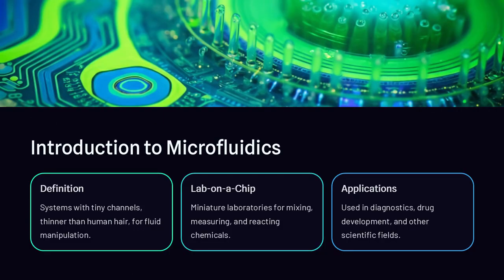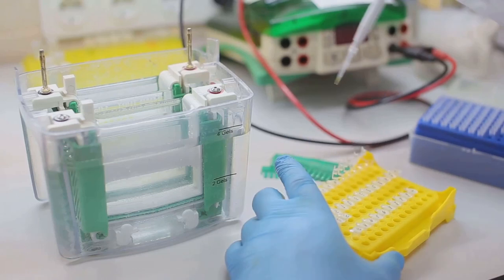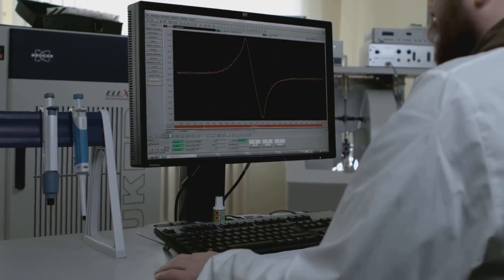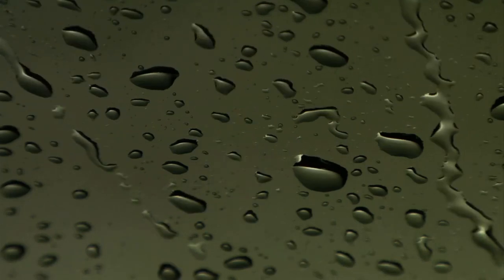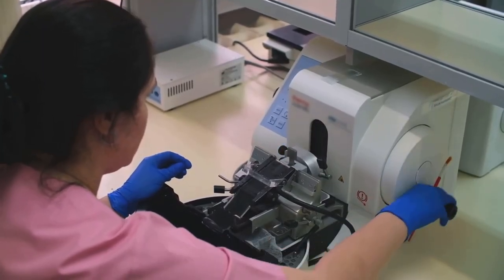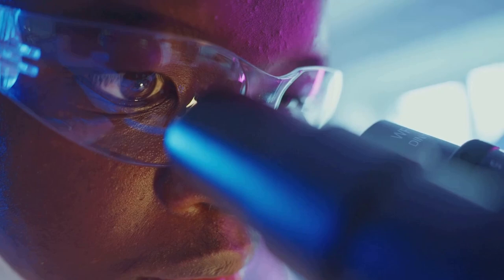At the microscale, the physics of fluid behaviour changes drastically compared to what we see in larger systems. In everyday life, we often observe turbulent flow, where liquids swirl, mix, and create chaotic patterns. Think of a river or even cream mixing into coffee. But at the microscale, laminar flow dominates. This means the liquid flows in straight, parallel layers with minimal mixing unless intentionally forced. Surface tension, which refers to the cohesive forces between liquid molecules, becomes a major player. It can cause fluids to form stable droplets, resist breaking apart, and behave differently in small channels than they would in a larger container.